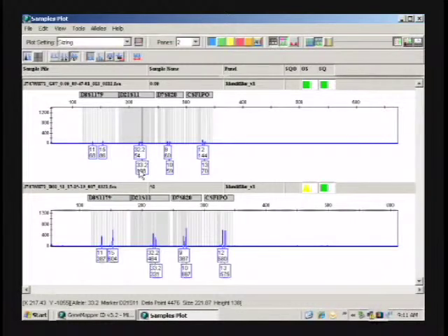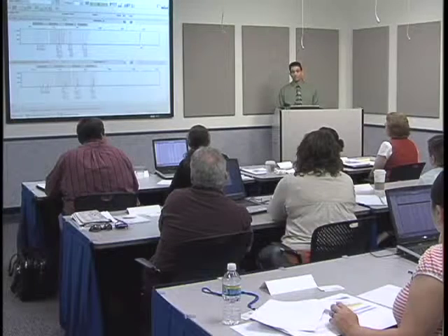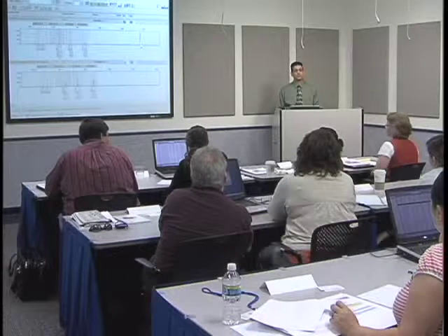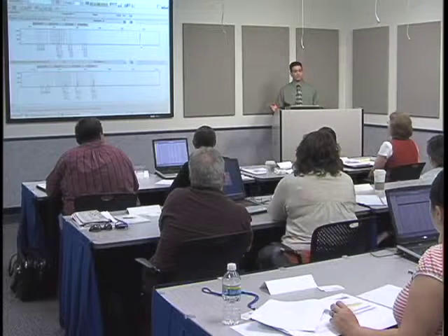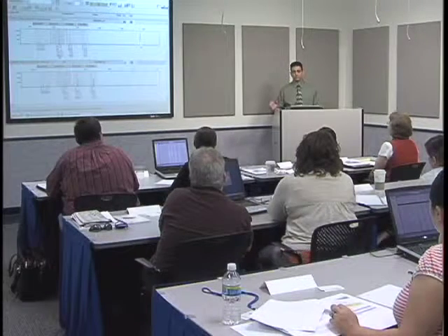But what's a consensus in the room? Would you say your calling thresholds are like...? We have two, so the limit of detection is 50. Okay. But then our stochastic threshold to use something statistically is 230. 230. Okay. 125. 125. Okay. 150. 150. 75. Okay. So anywhere from 75 to maybe 250, 300, we'll all be in there.